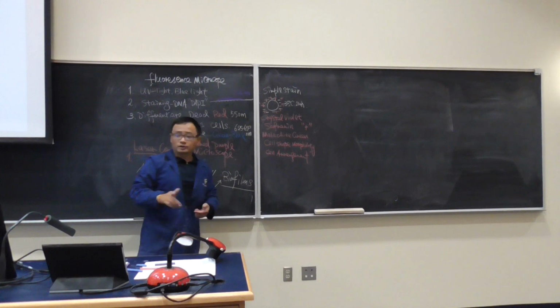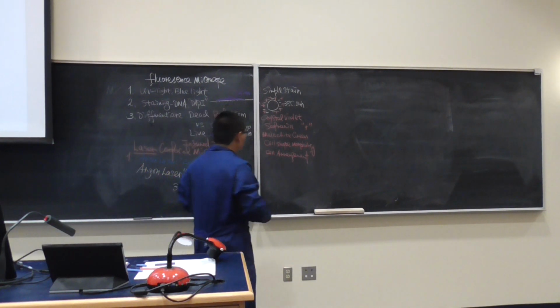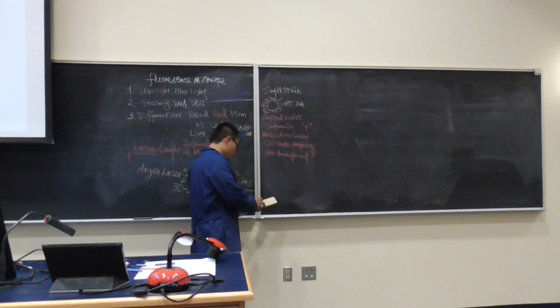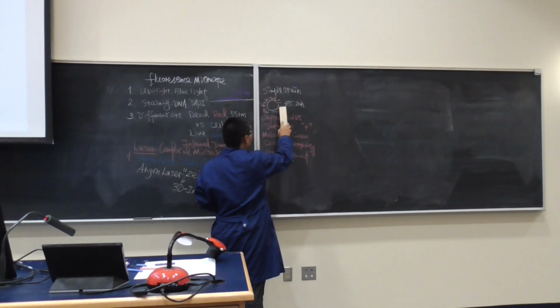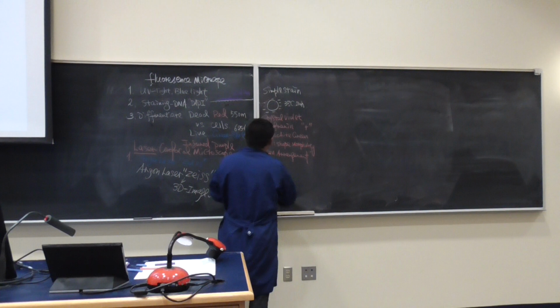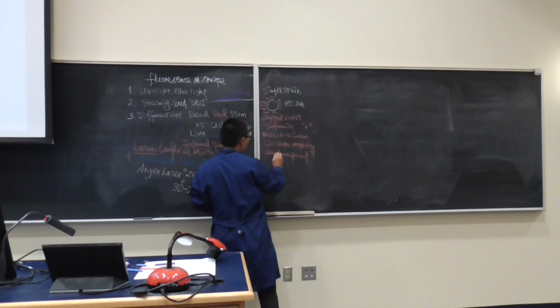Now I also want to mention in these slides, we could also do another different stain. Instead of using crystal violet, safranin, malachite green, we could use other stains, like nigrosin, Indian ink, these are negatively charged. So if they are negatively charged, we call it a negative stain.